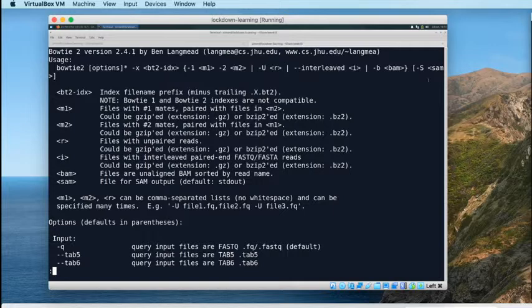By default, Bowtie2 will produce its output to standard output, so it will print its output to the screen. That can be quite useful, and lots of well-written bioinformatics software will produce its output by default to standard out. There's also lots of software that doesn't do that, especially software that produces multiple files, like Bowtie2 Build, for instance, which had to produce multiple files. So it couldn't produce that output to standard output because you can't separate the output streams then. But where you're producing one artifact of output, in this case an alignment, that alignment is produced by default to standard output because that allows us to redirect that output stream into other tools should we want to. And we can look at examples of doing that later on.